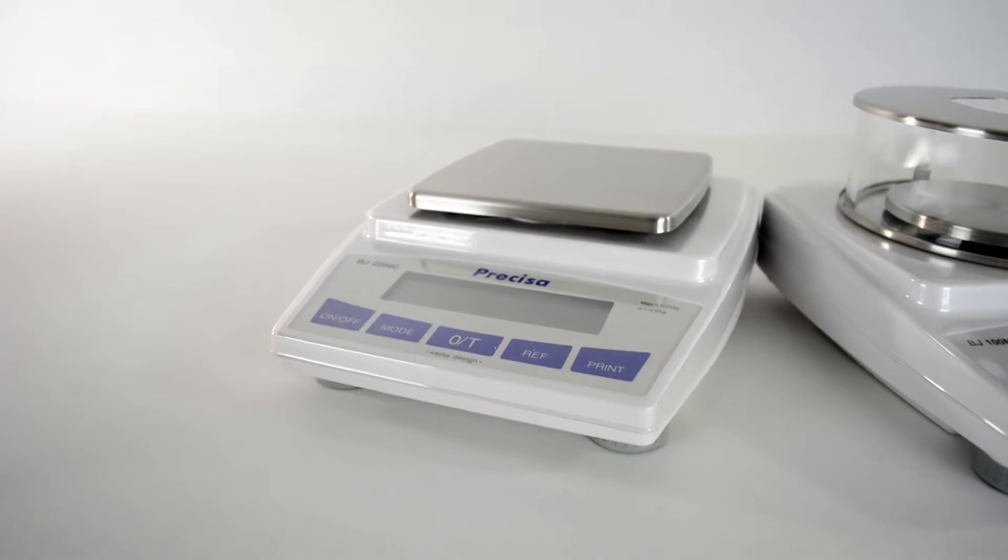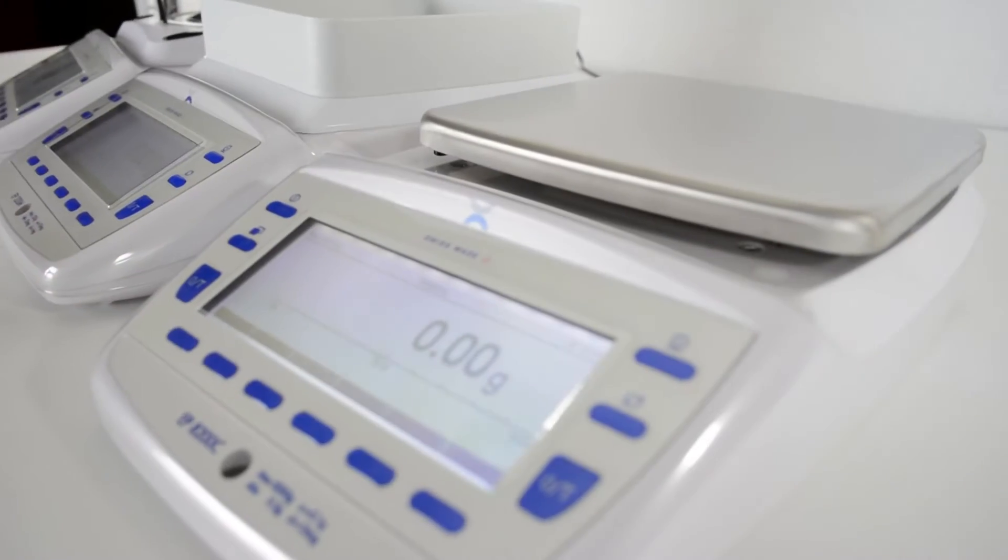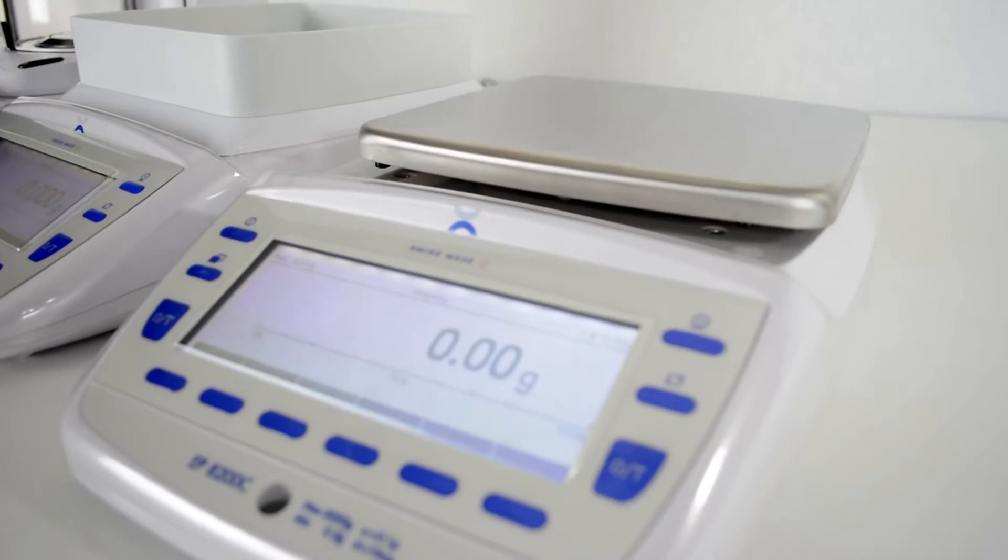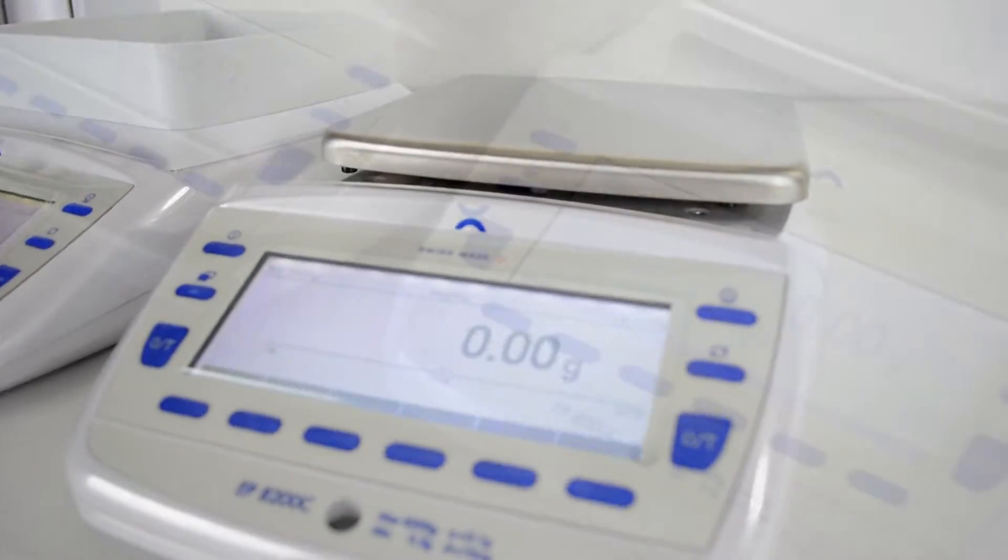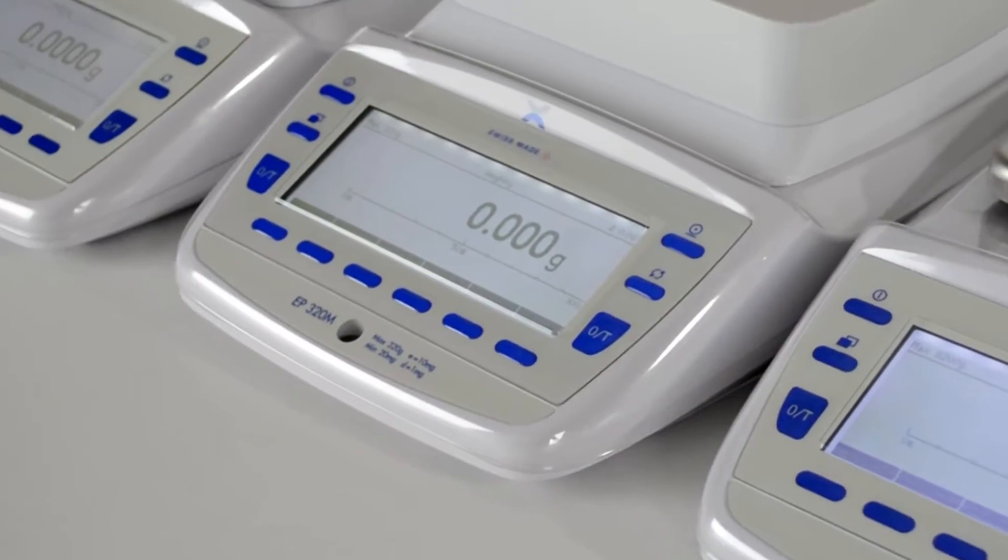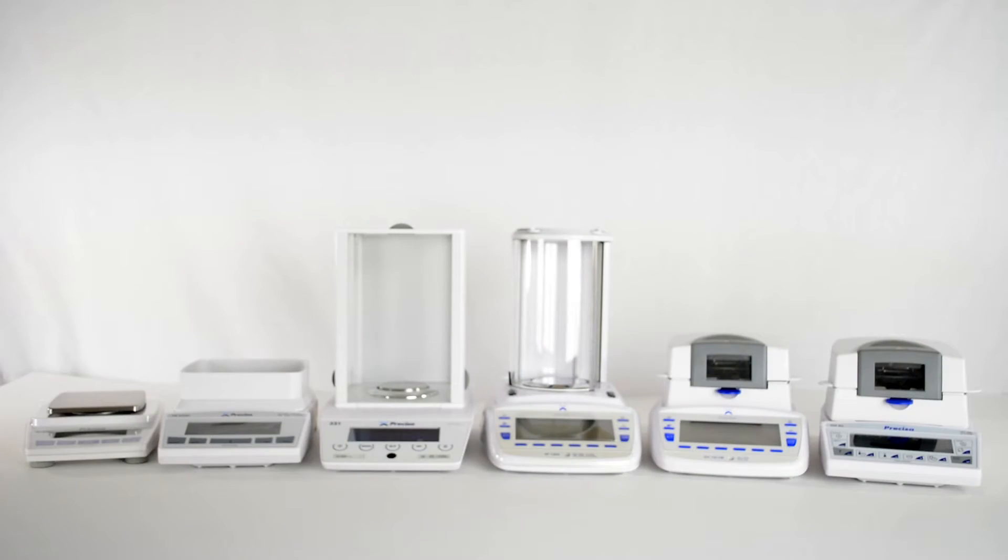After working closely with academic, laboratory, and industrial partners, Precisa fine-tuned their own line of precision balances through careful engineering and customer feedback.